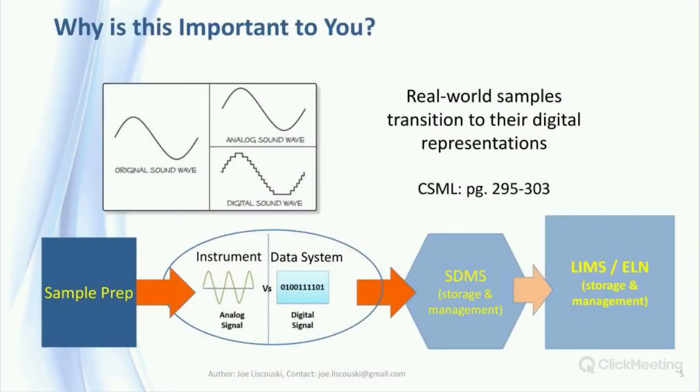Why is this important to you? The connection between the instrument output and the input to the computer systems represents an important transition. That from physically working with the samples to working with measurements made on those samples in digital form. We no longer interact directly with the data, but let a computer system process it. Everything that is derived from the resulting information is based on the assumption that the processing is done properly. All the work that goes into preparing samples for analysis can be wasted if that assumption isn't tested and replaced with a proven determination.